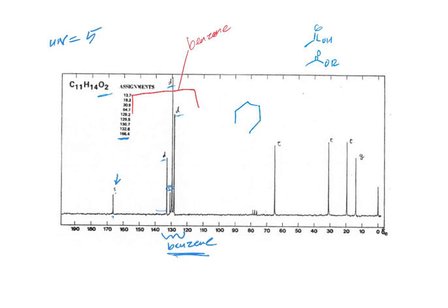So why do we only see 4 peaks? Symmetry, exactly right. Okay, the small one says singlet, but we've already talked about how quaternary carbons tend to be smaller, right? Because of the lack of NOE with decoupling, and because we may not give a long enough relaxation delay to allow those carbons to fully relax. So we have a single quaternary carbon, which is the attachment point, right? And then the 2 big ones would presumably be the ones that are doubled up.